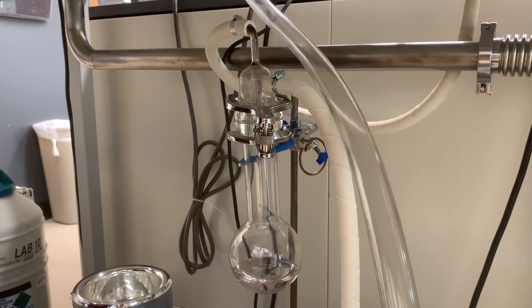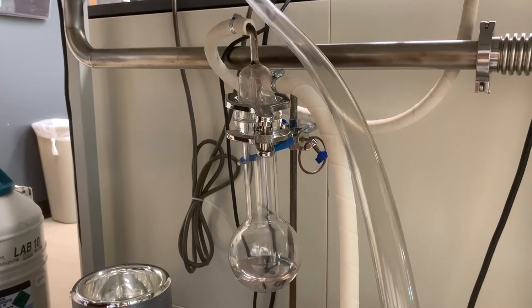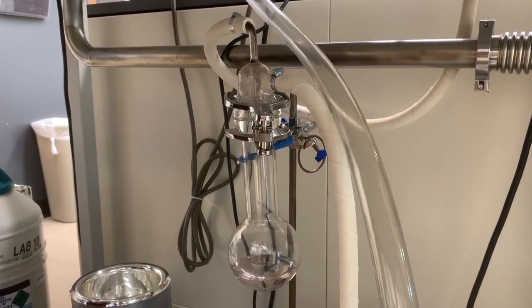This is how you'll usually find the solvent trap at the beginning of the day. It's still assembled, but without its o-ring, at room temperature, and with some liquid that was captured from the previous day's work.